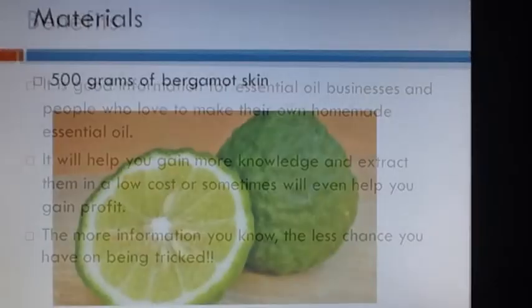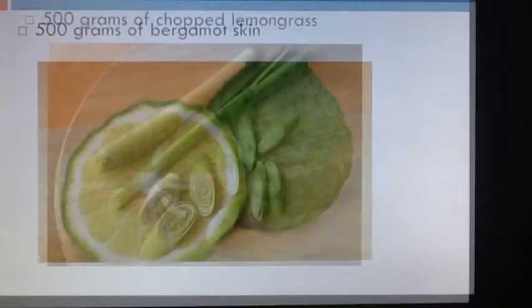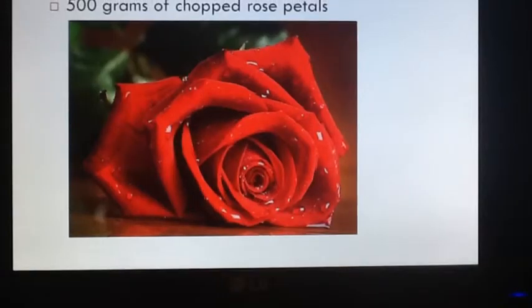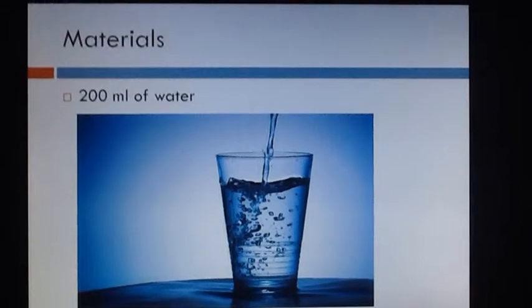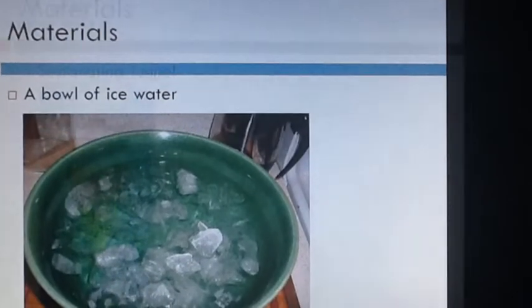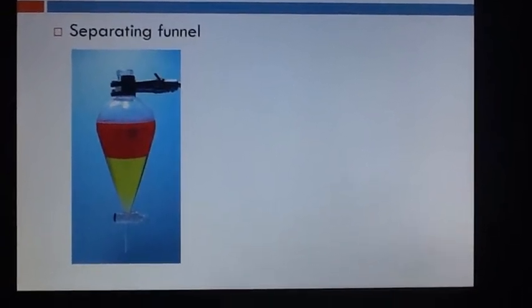So the materials are 500 grams of bergamot skin, 500 grams of chopped lemongrass, 500 grams of chopped rose petals, 200 milliliters of water, and a steam distillation kit. It may be expensive, but it'll be very economical and you can reuse it many times. A bowl of ice water, it can be a bucket if you want, and a separating funnel to separate the hydrosol and the essential oil.